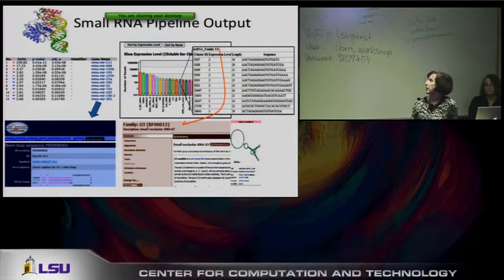Additionally, we might be interested in families and how similar these microRNAs are to each other. We might want to sort these by expression level, and again, link out to additional information elsewhere.